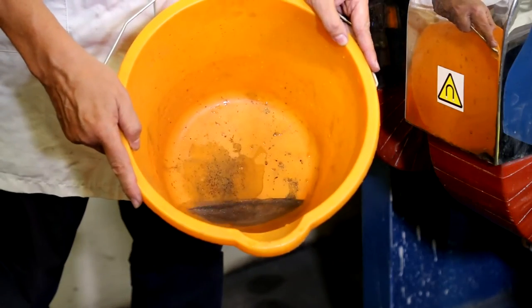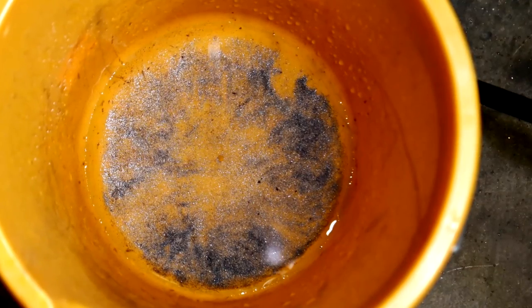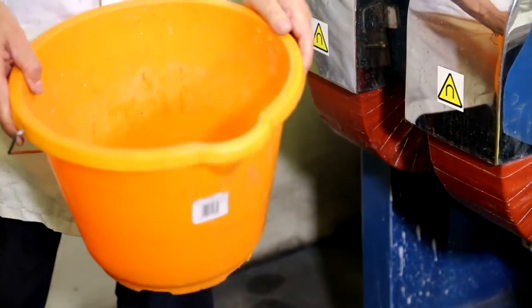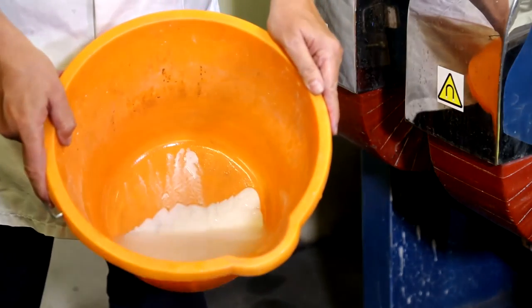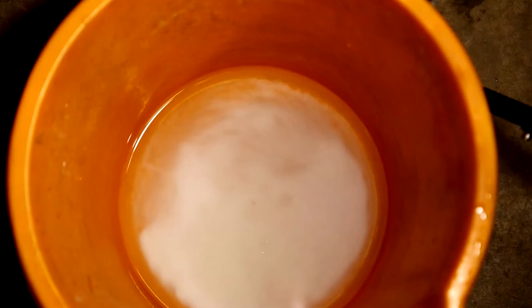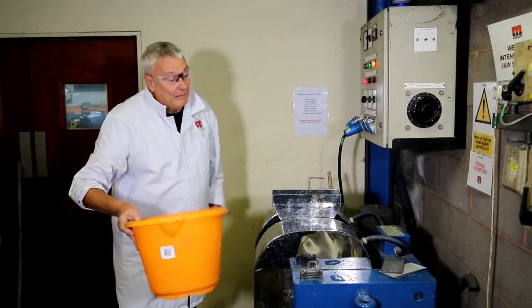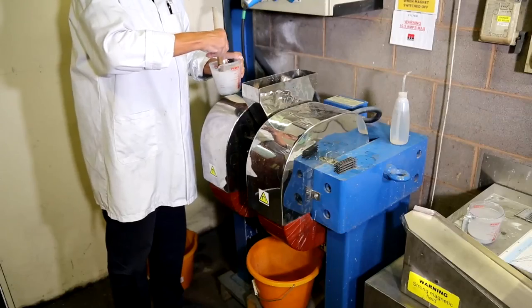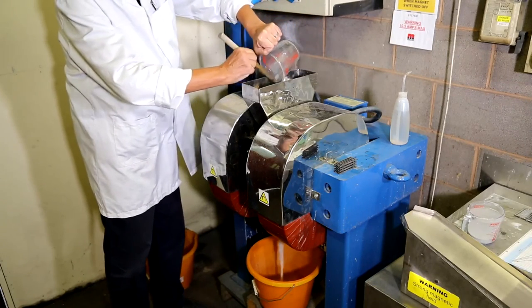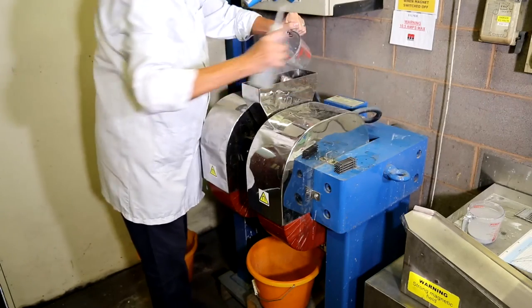If you look here, we have beautiful black mineral particles — that's the paramagnetic hematite — and here we have the pure white calcium carbonate material that will be at the required iron level for processing for the ceramics industry or the paper industry. So this is a highly flexible machine. It's a lab version of industrial scale units that can be in carousel form or batch filter type forms, and as a laboratory piece of equipment it's very, very useful indeed.